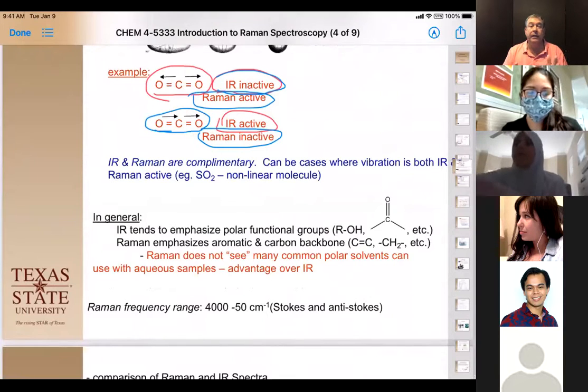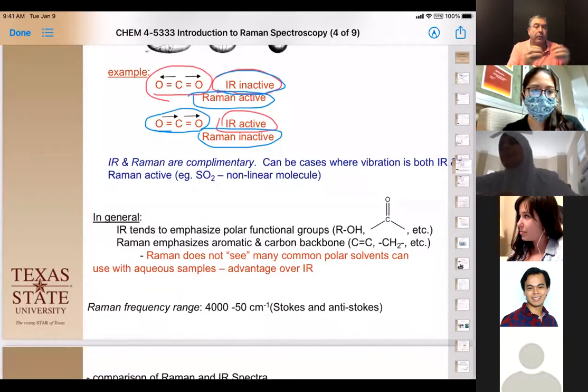So if your compound is IR active, let's say the OH bond, it's going to show up in that first band region, right? If there happens to be a non-symmetrical, polarizing vibration available to it, you will see it in Raman in that exact same place.